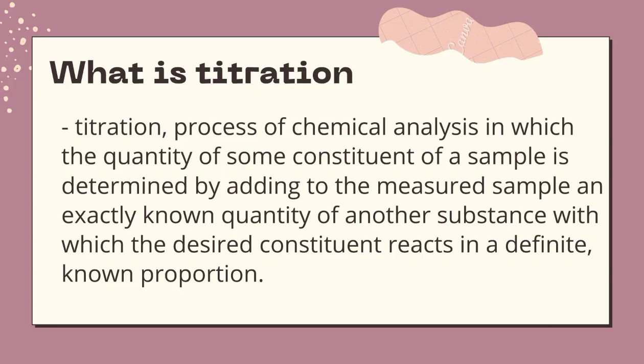So, before that, what is titration? Titration is a process of chemical analysis in which the quantity of some constituent of a sample is determined by adding to the measured sample an exactly known quantity of another substance with which the desired constituent reacts in a definite known proportion.